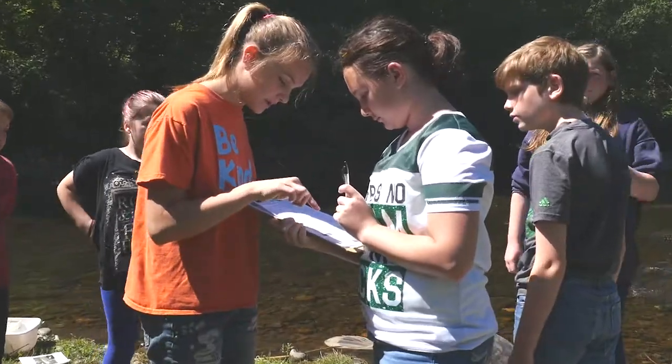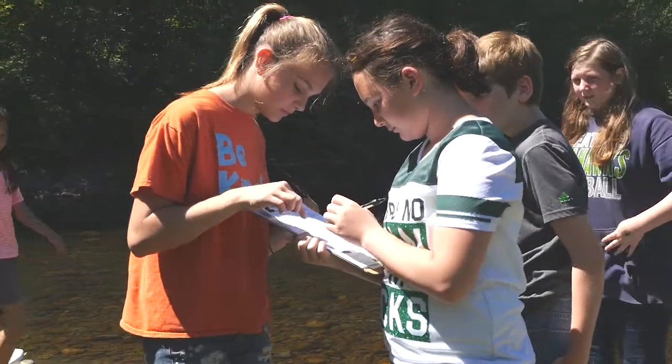Make sure that all of the macroinvertebrate data gets recorded and all students use their sheet to get a water quality rating.